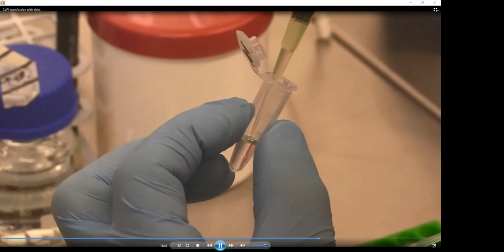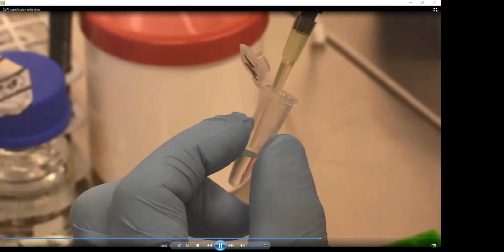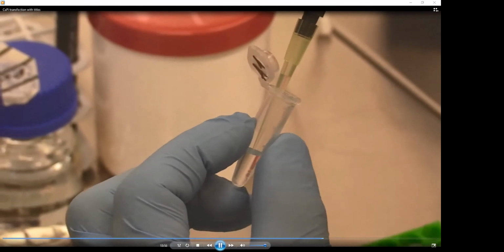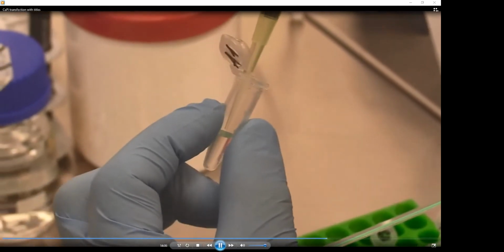What you can sometimes notice is that the solution will change to turbid. It will be slightly milky, and this is something positive which may or should happen. That's the formation of the complex and can be sometimes visible.